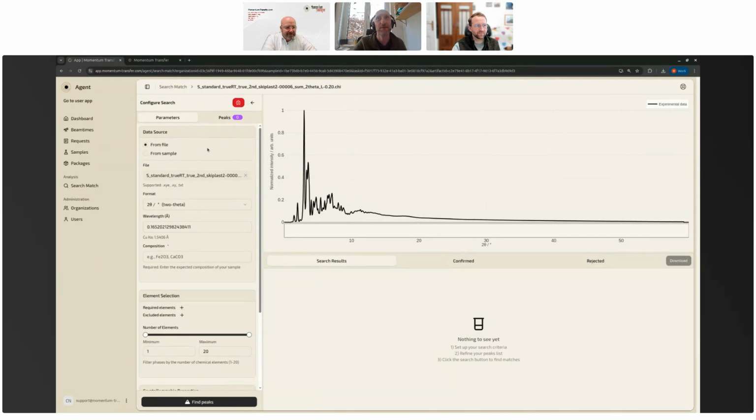sulfur at the NSLS, I think 1. So maybe 15 years ago or something like that. And I don't remember, to be honest, if it's nanocrystalline sulfur or if it is a total scattering measurement. So it might just be that the resolution is not good, but you could take it as either way. So let's say for all intents and purposes, this is very small nanocrystalline sulfur. Okay. And this is the data set that I measured at a different facility or on my lab source. So now you can change the wavelength because I assume it will not be the same as what we use.